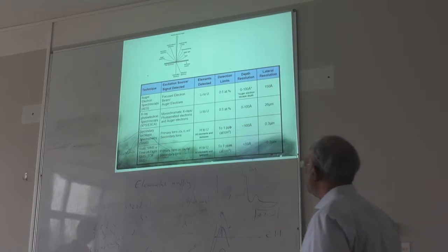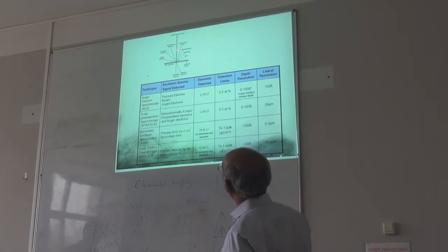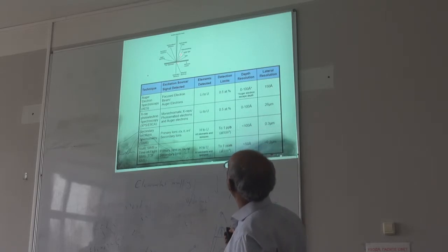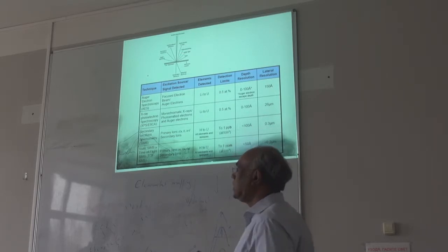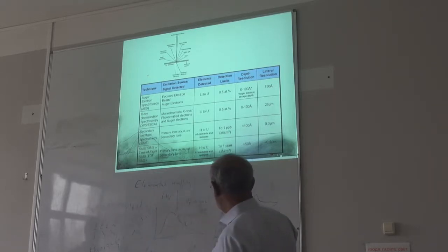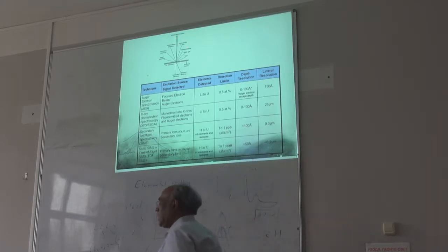Also there are some other signals. This is a very important thing to understand. If you have an incident electron beam, there are so many things that can happen, right? You have the Bremsstrahlung, the broad X-ray background. Then with X-rays, we have the sharp peaks, like copper alpha or copper beta. This also comes from scattering.